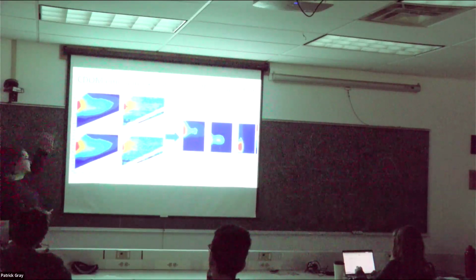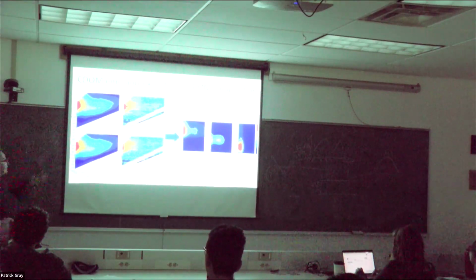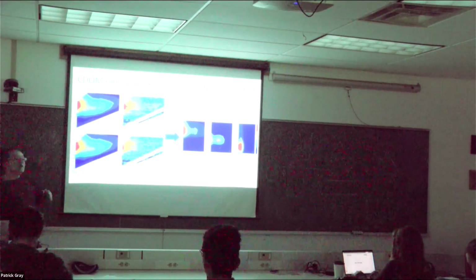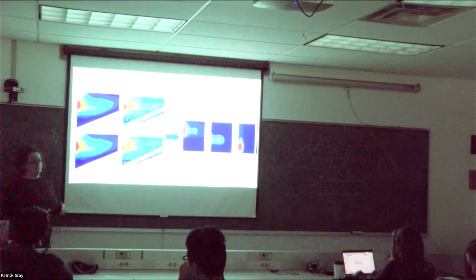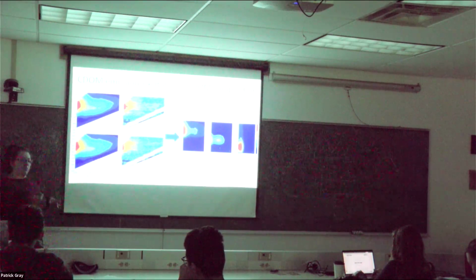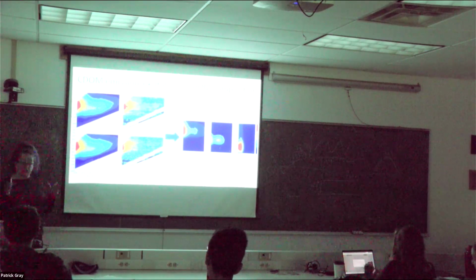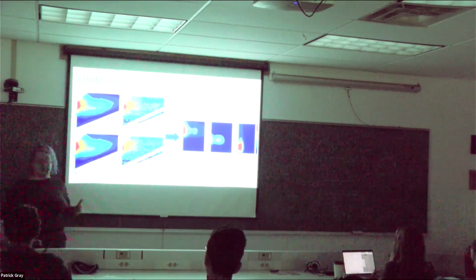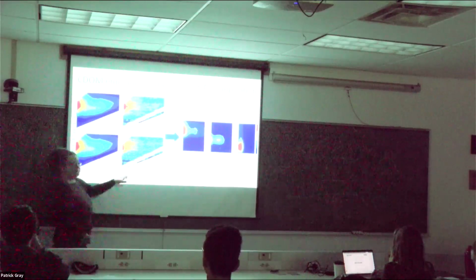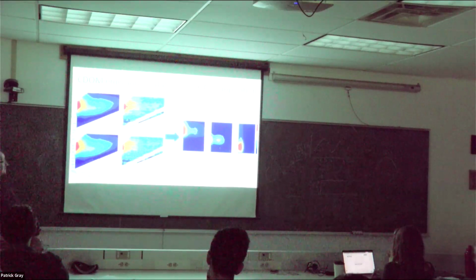So this is called an excitation emission matrix. This is from a paper by Zelinsky et al. And he took samples of water, on the left graphs, two samples of water, obviously, and took them into the lab and measured this excitation emission matrix. And Meg was trying to do the same for the DRE last night, but she's going to do it again, so you can have your excitation emission matrix for your CDOM, for your dissolved organic material water, so you can see how it looks. But what is really cool, he developed a teeny tiny instrument that can do that in situ. You can deploy it on a little autonomous vehicle and stuff.